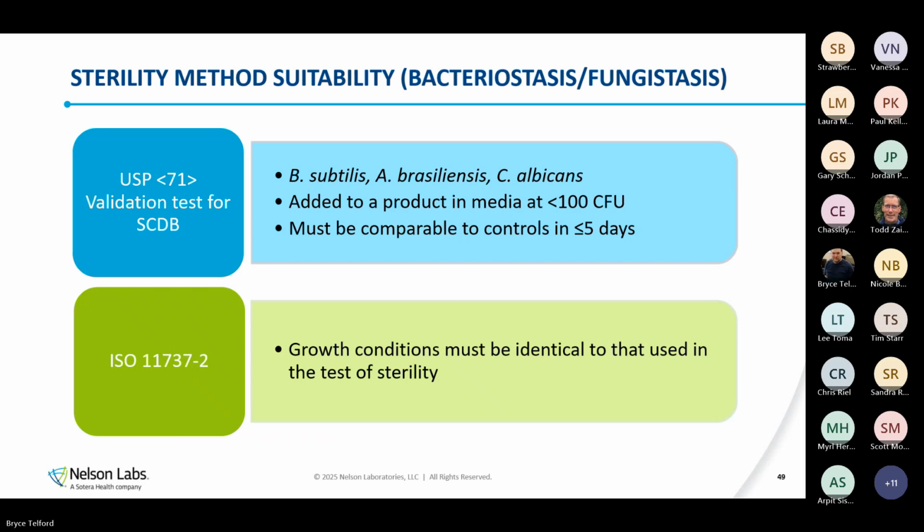So your entire validation really relies on demonstrating that sterility. Your entire sterility test and all those results rely on an acceptable and passing BF test. So the BF test is absolutely going to be a critical point that auditors are going to look at.